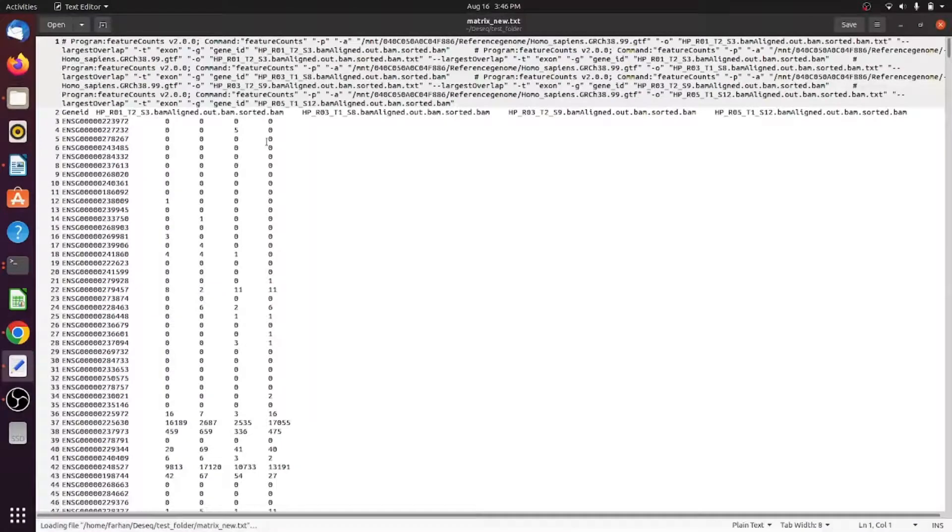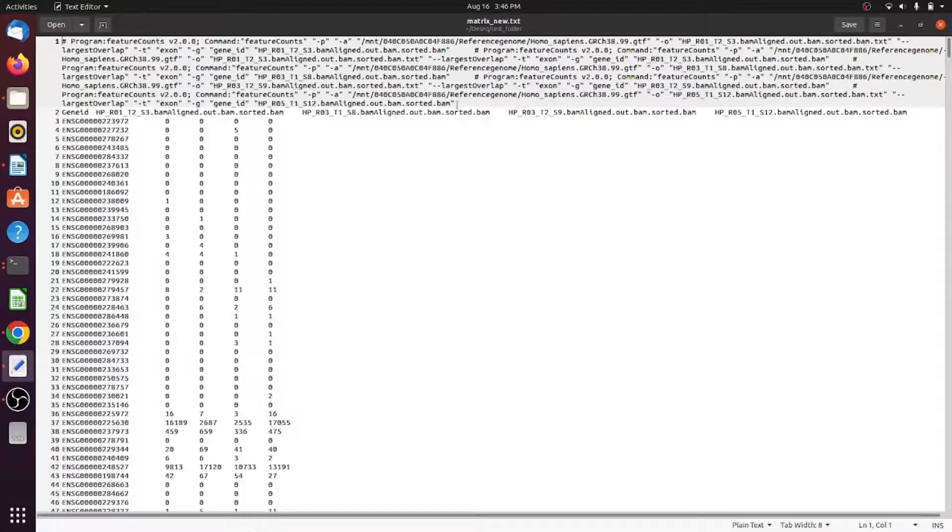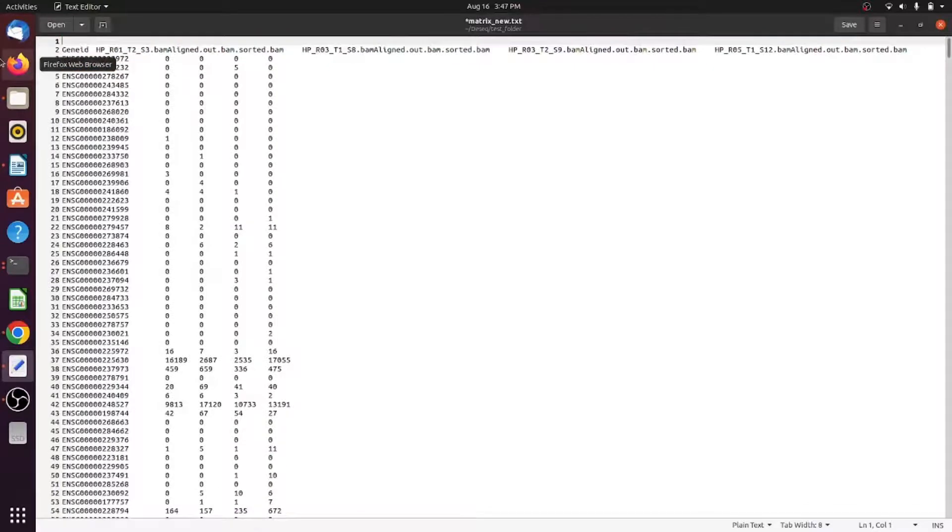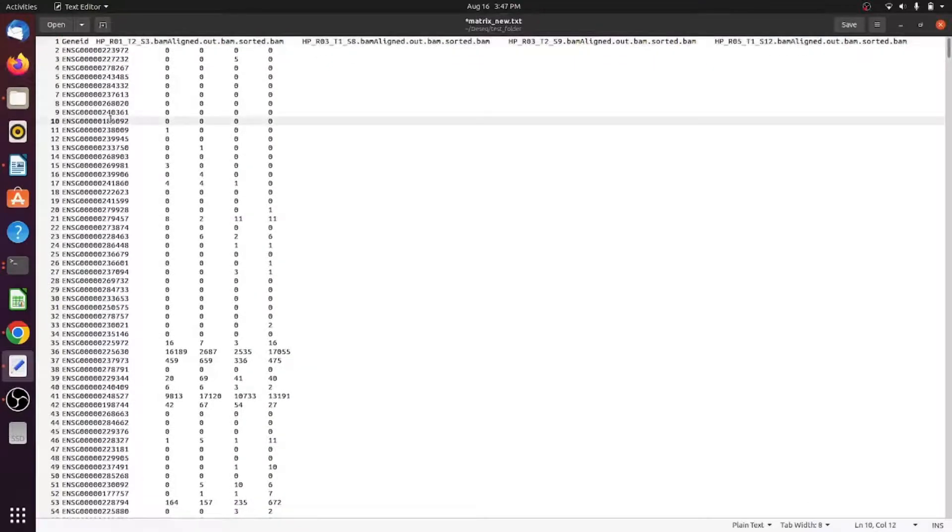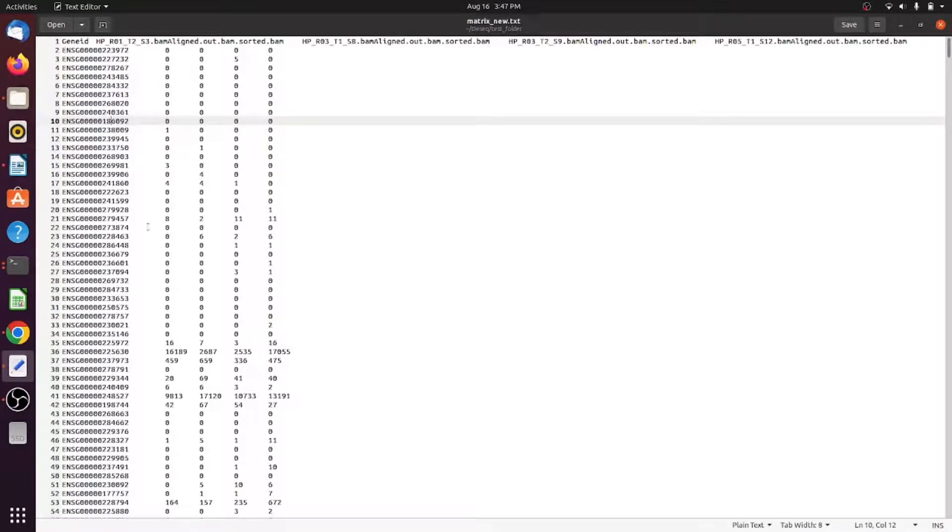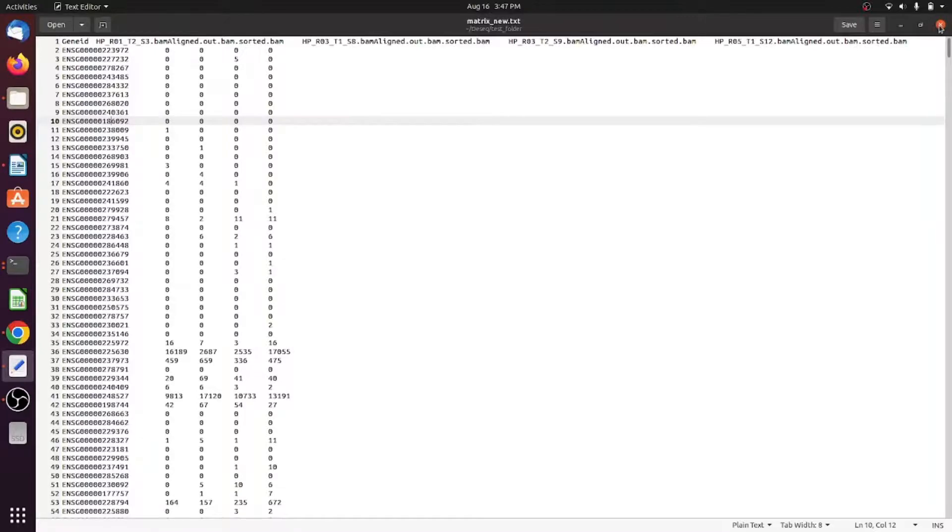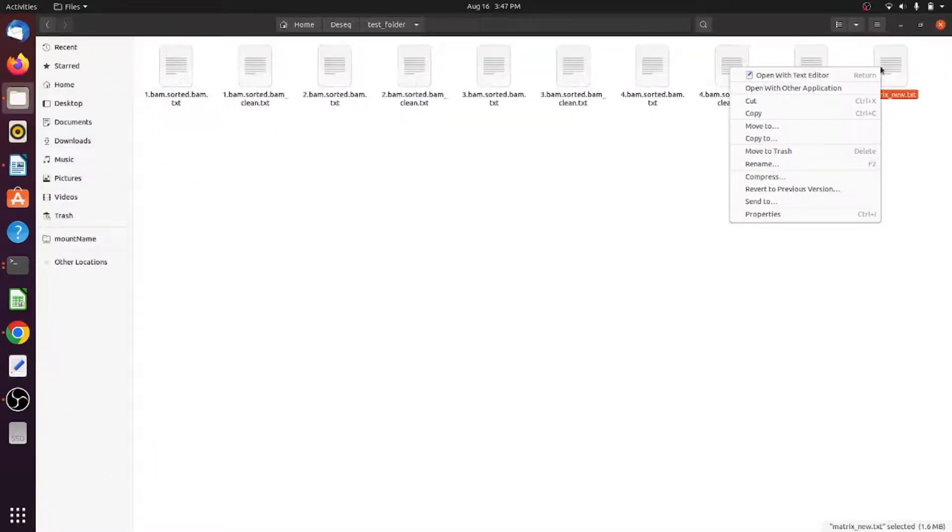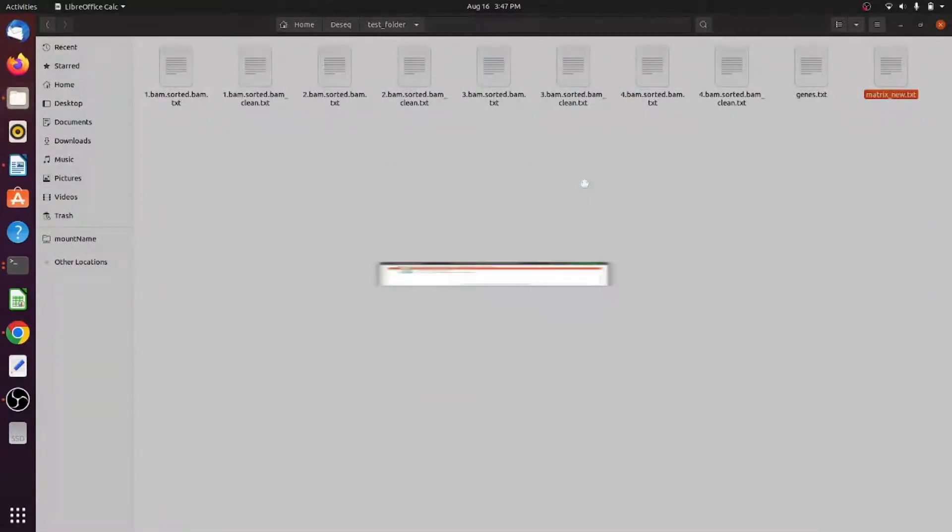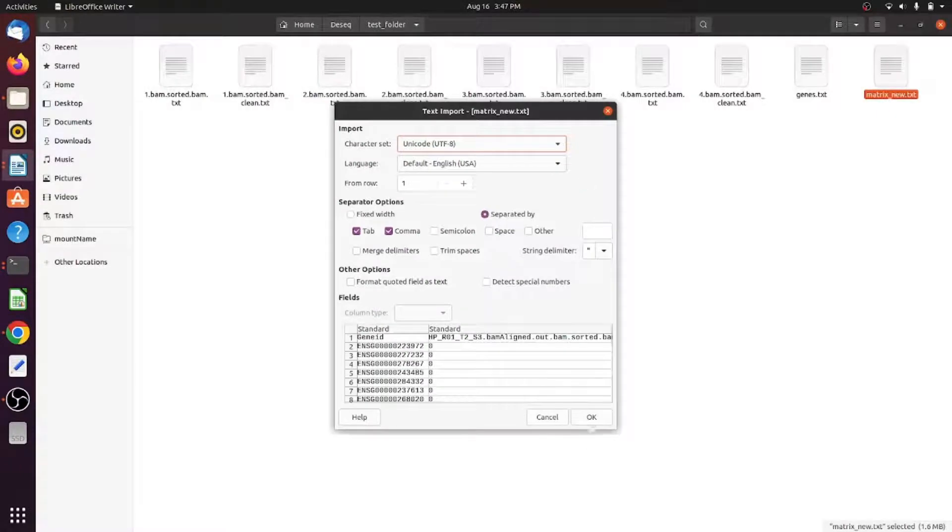If you want to open it, you can open it. The first line you can delete because that's extra. Now this is the DESeq input for DESeq or edgeR or limma or any other differential expression analysis. To make it more clear, I'll open it in Excel.